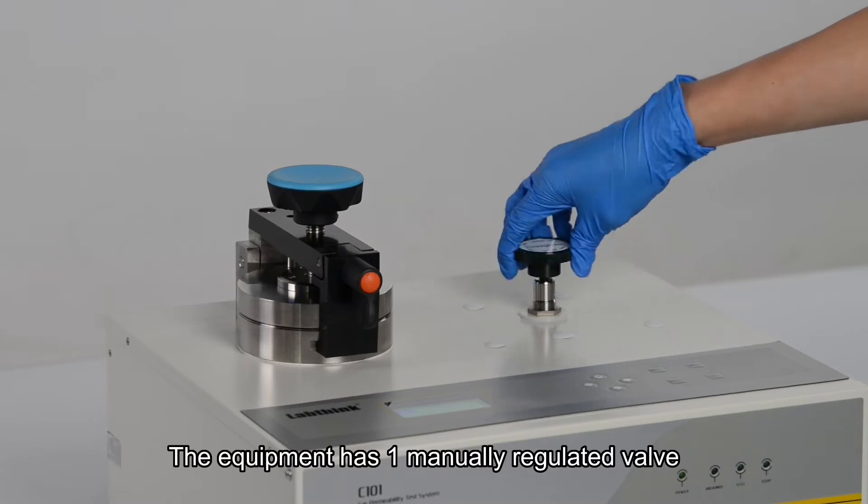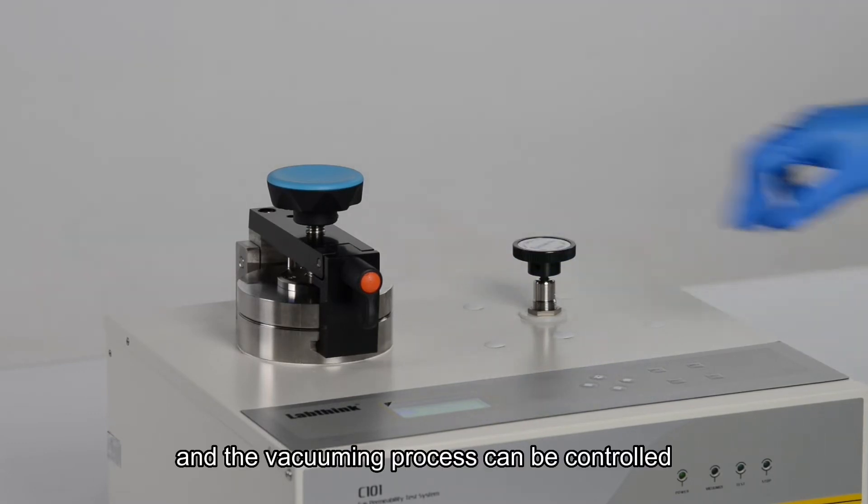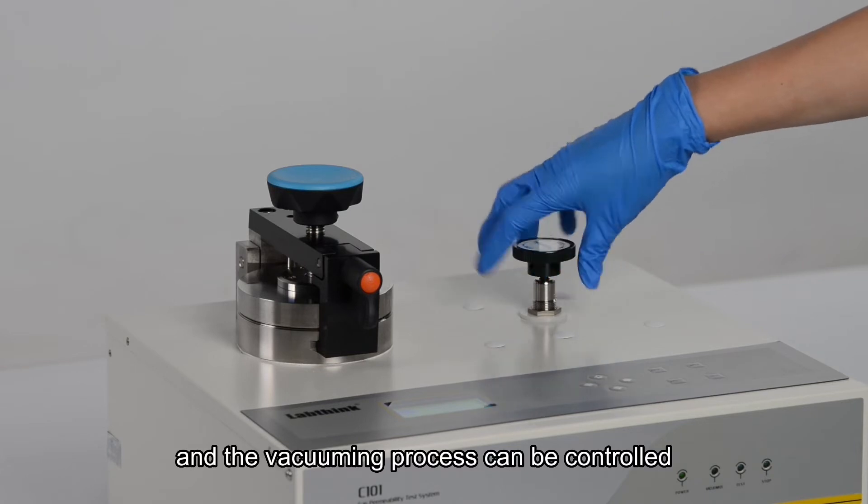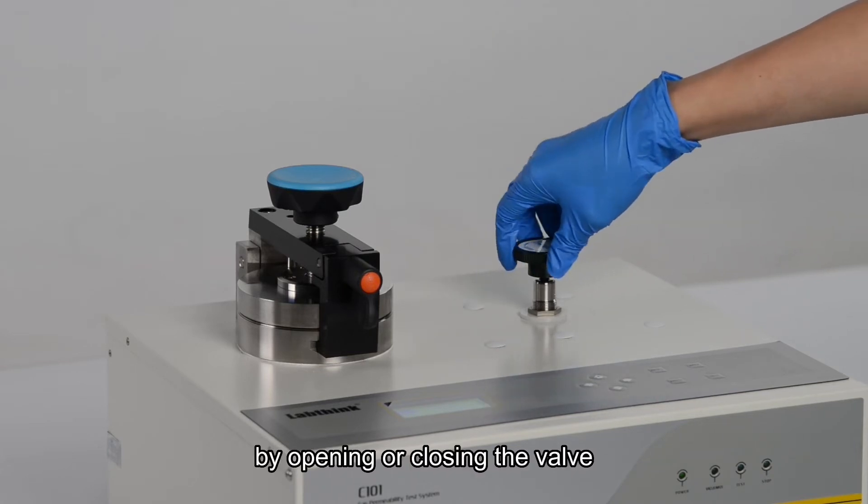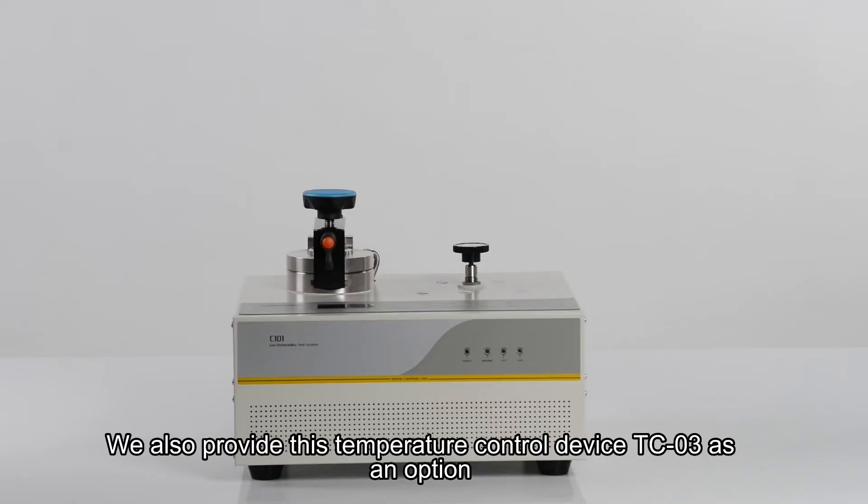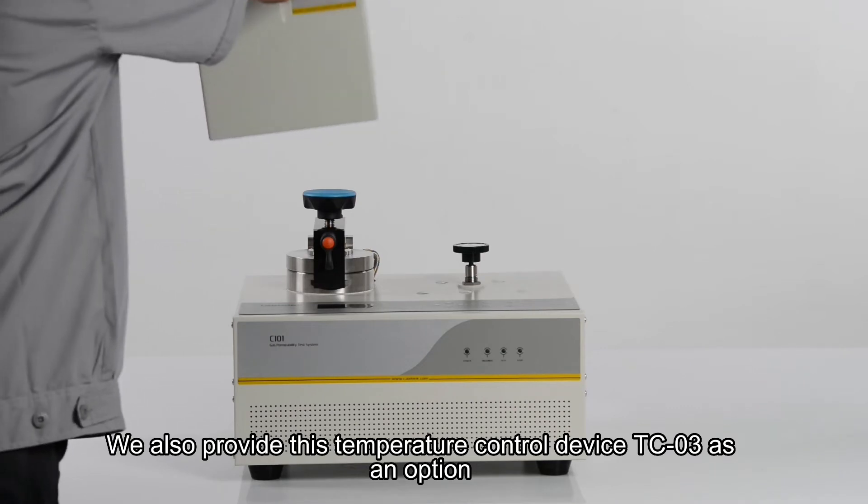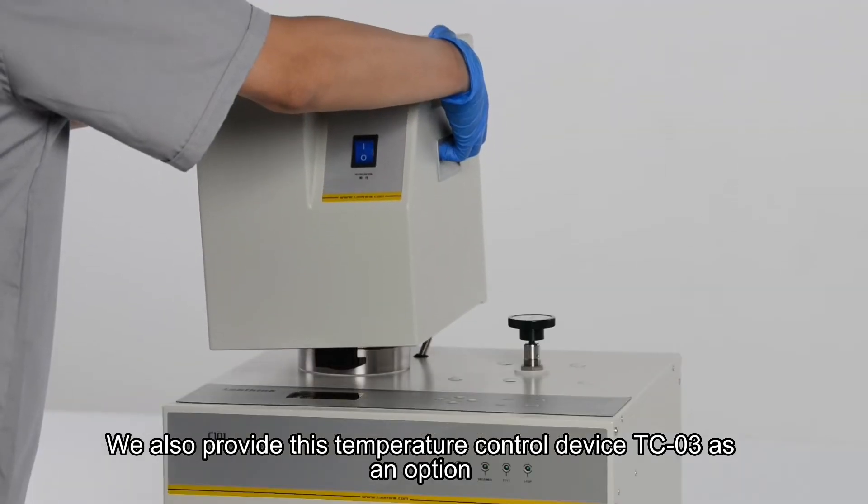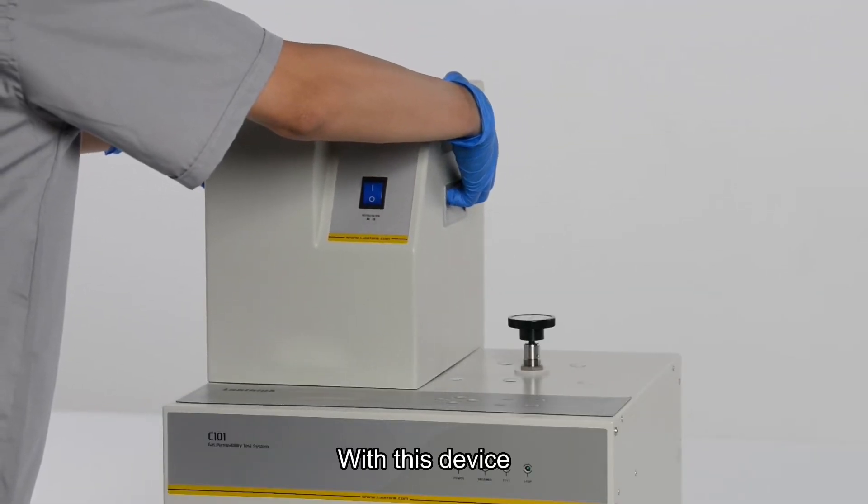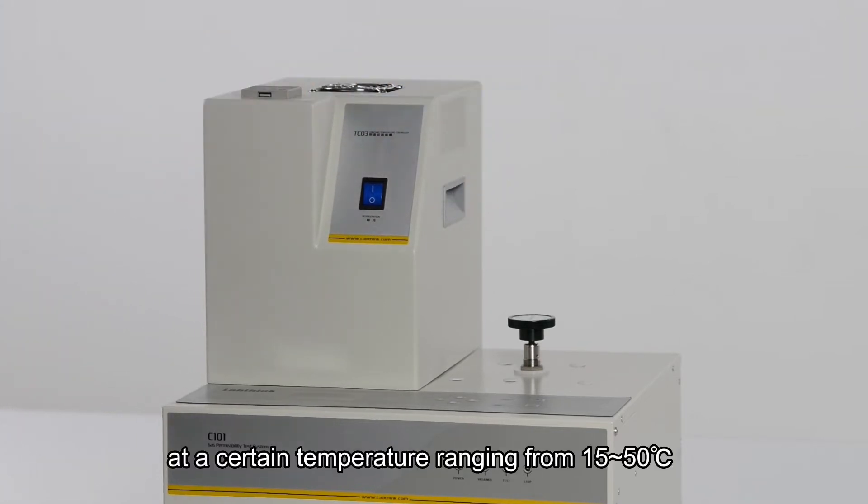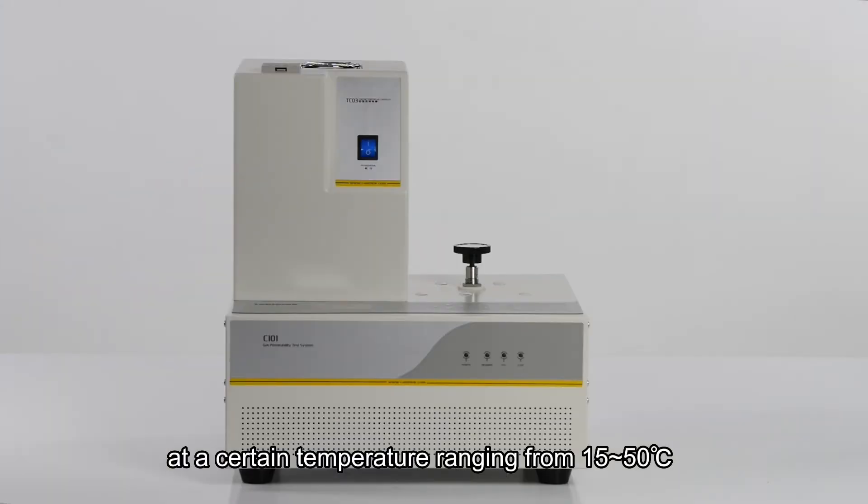The equipment has one manually regulated valve, and the vacuuming process can be controlled by opening or closing the valve. We also provide this temperature control device TC03 as an option. With this device, the test can be conducted at a certain temperature ranging from 15 to 50 Celsius degrees.